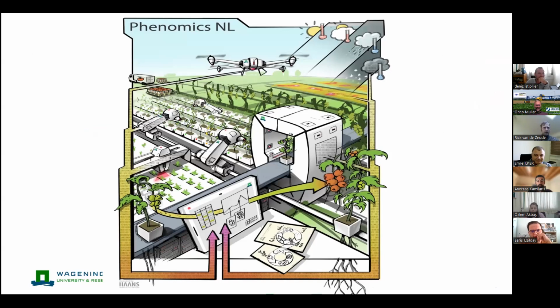So phenotyping is all about gathering data. Drones capture data, cameras capture data, but it doesn't end there. You can capture data by using your mobile phone, taking a picture of something, but then you only have one big blob of data. It actually becomes useful if you turn it into a graph or into a table, and then understand why certain plants grow weak, other plants grow strong. No, the phenotyping doesn't end at the imaging. It actually starts at the imaging. It ends when you have a number, a graph, a comparison between your treatment and your control.